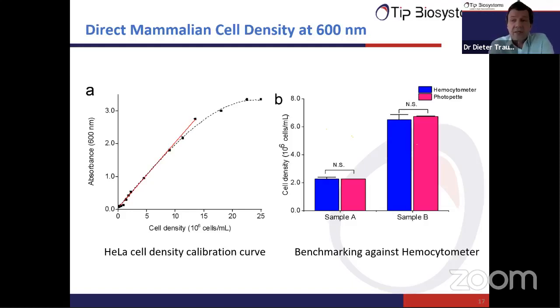There are also inbuilt calibrations for E. coli and yeast and spirulina, the superfood algae spirulina, which in reality is not an algae, but is a cyanobacteria.